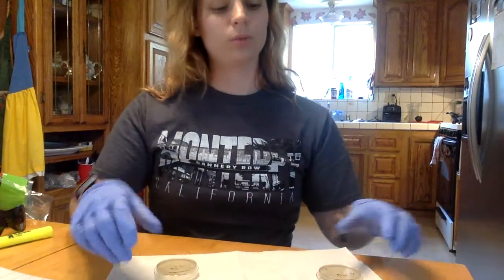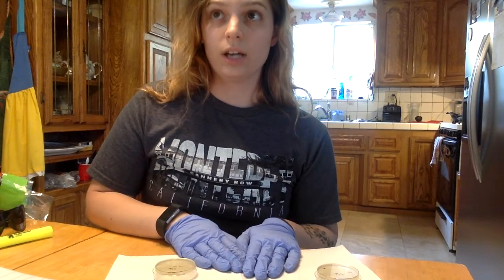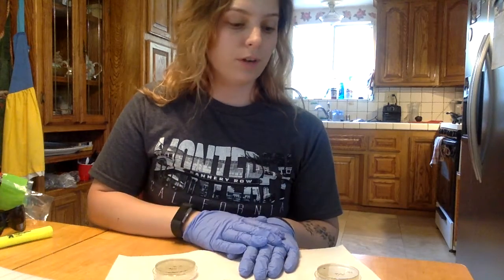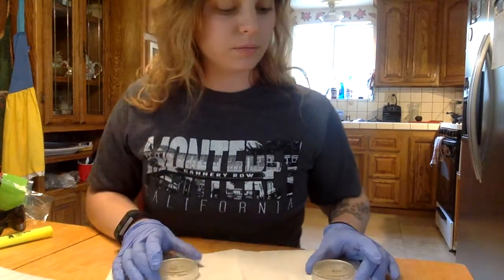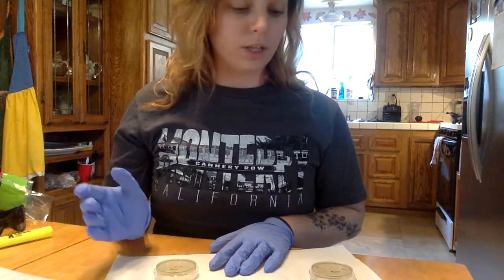Today is July 15th. It is around 6:40 p.m. and I just want to go over the results that we started on July 11th. Around 5 is when we started this process. The process began after creating the agar plates.